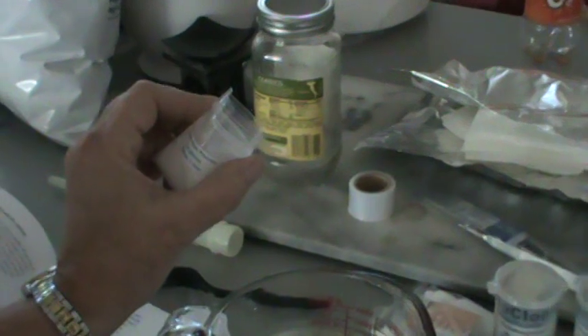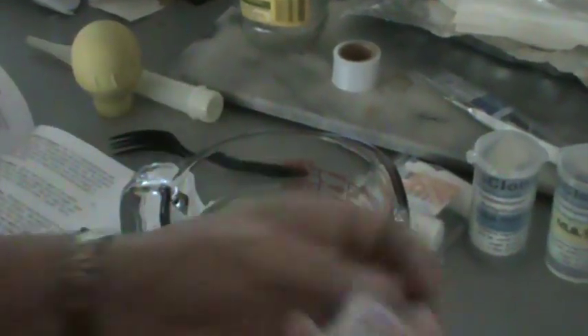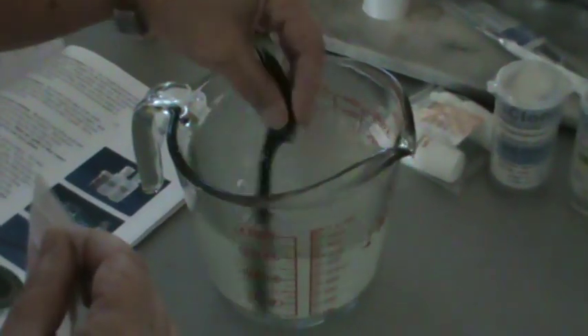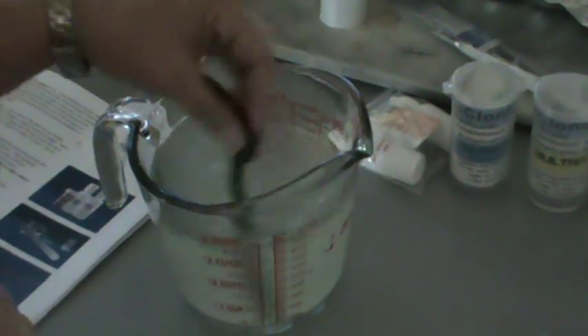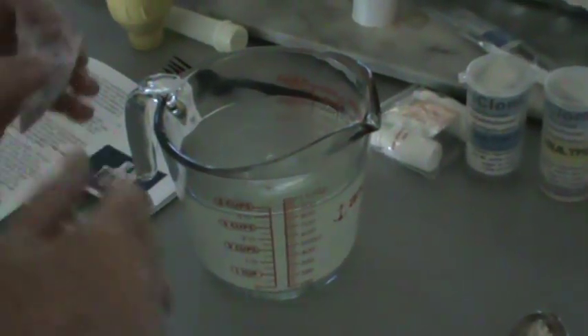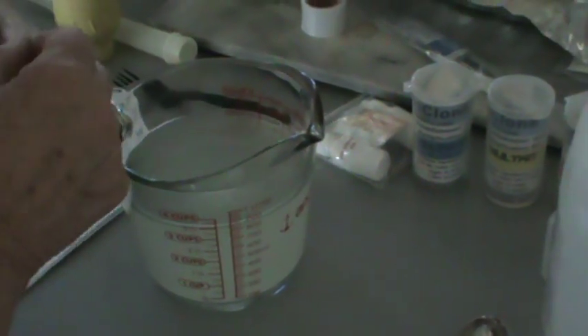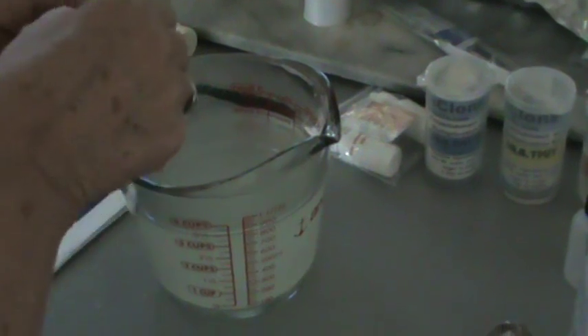Now this is the gelatin powder. I'm going to stir this so it doesn't clump. This all makes enough for one liter, and one liter will fill our 20 jars and a couple other containers that we're going to try to propagate some stuff in quickly.